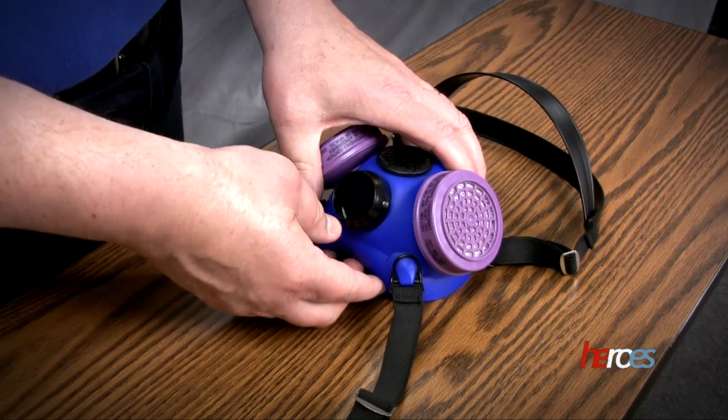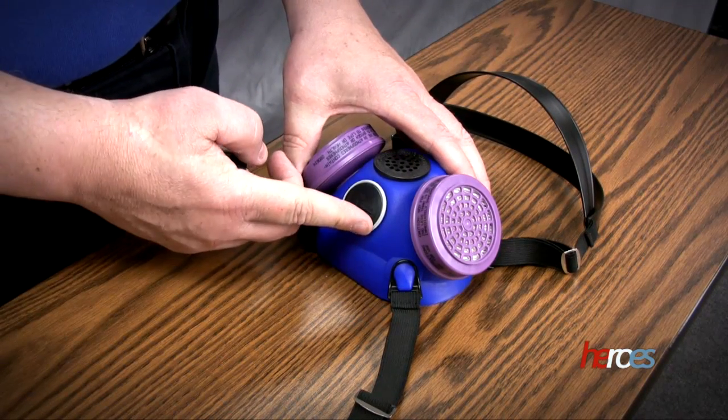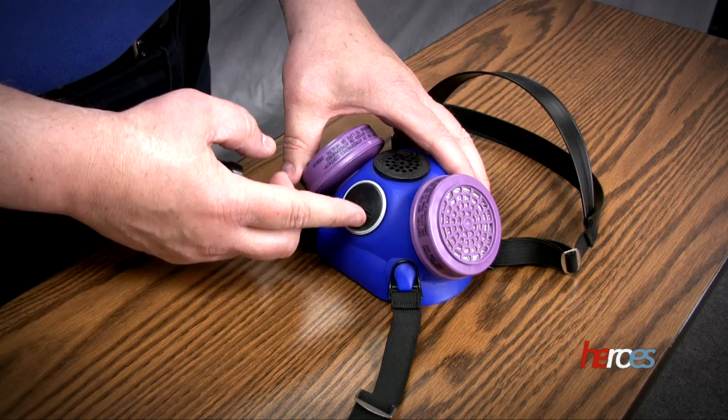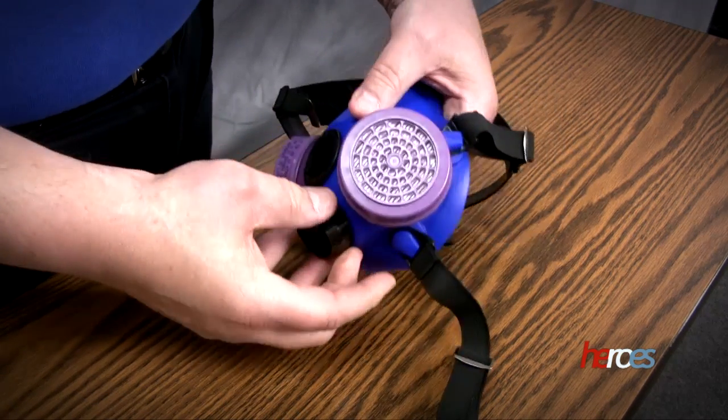You want to take a look at the exhaust valve to make sure it's in place. It's at the bottom of the respirator — it should be in place, soft, pliable, and laying flat. Snap the cover back on so it doesn't get damaged.